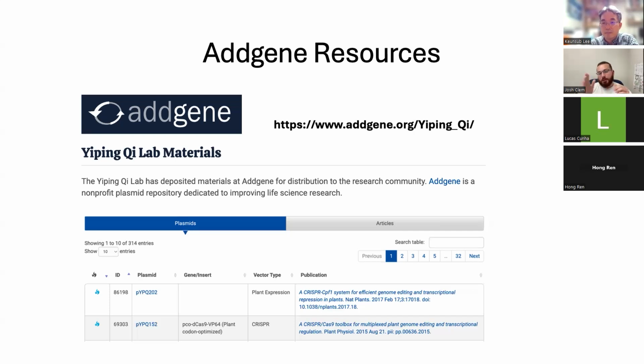So each plant has an amplicon associated with a certain combination of barcodes, and that allows us to pool all of those PCR reactions into a single tube, clean it up, and then we send just that one tube for Illumina sequencing. And because we've added adapters for them, it's like $55.